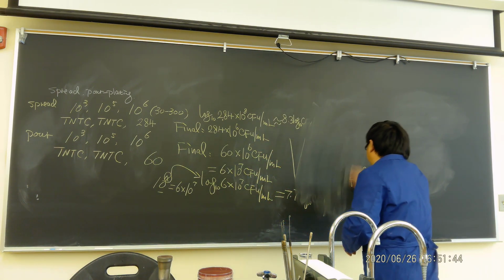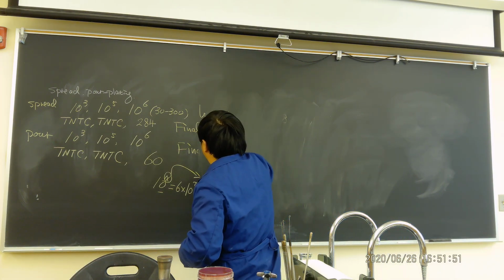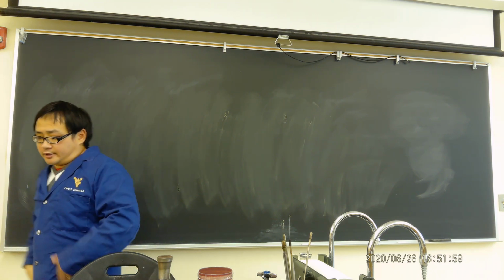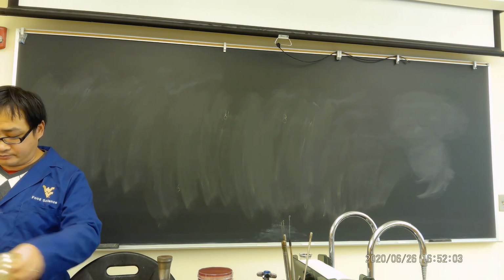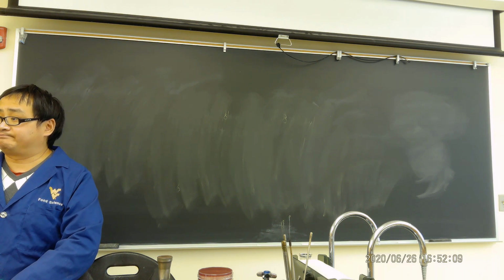Okay, we're going to do today's work. Today we will recognize bacterial media corresponding to the foodborne pathogens and do streak plating. One more time, you will have your plates there: that is E. coli.